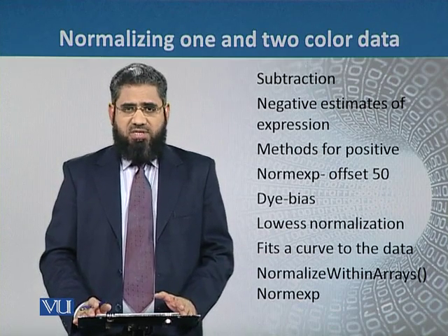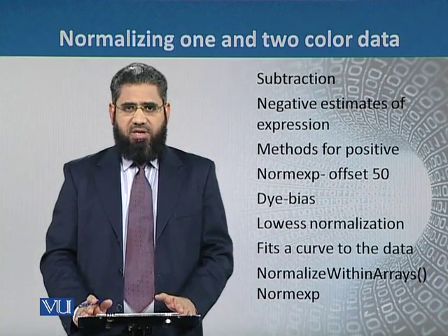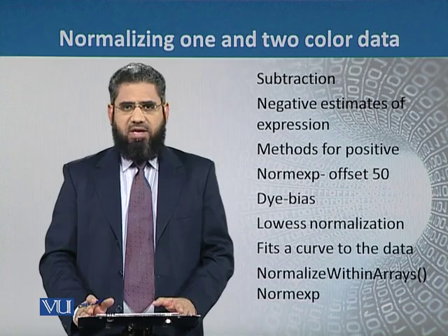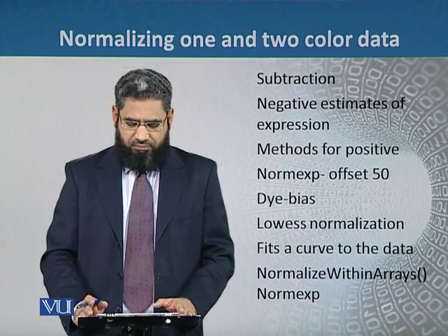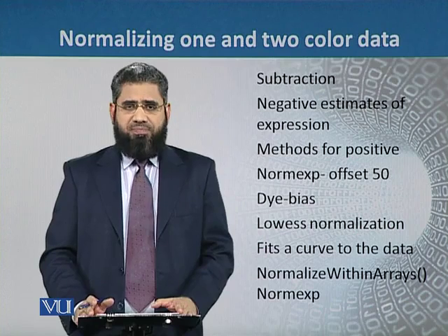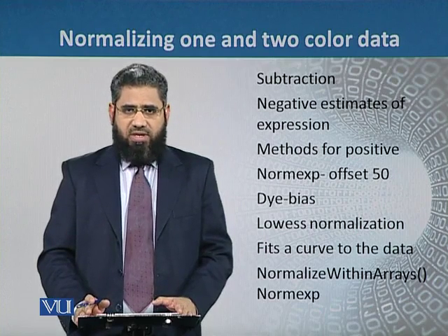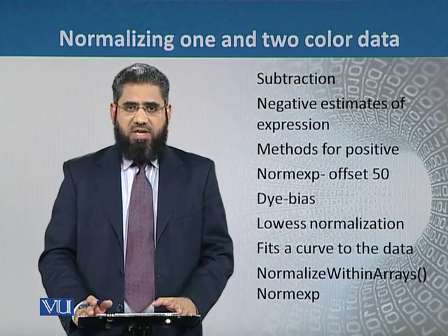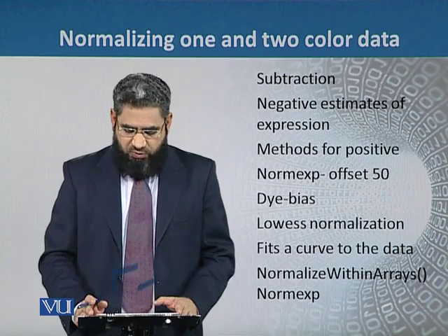The only drawback of this process is that when we subtract the background intensity, sometimes we get a negative value after subtracting from the spot intensities. To overcome this problem, there are many tools that we can use for the correction of background intensities, so that we always get a positive answer for all of the spots of the probes.